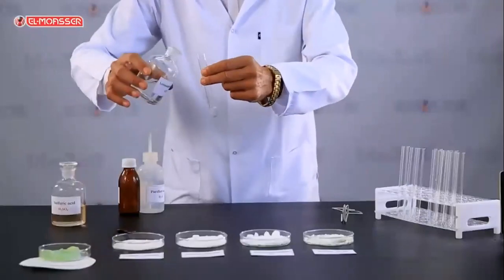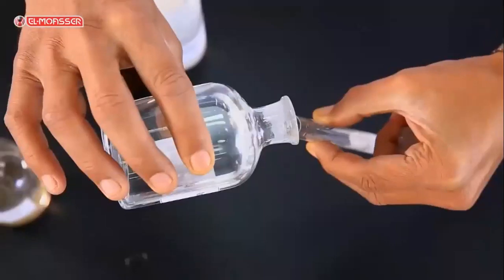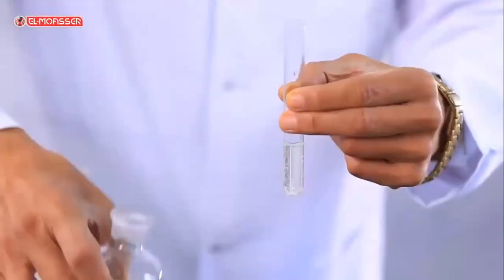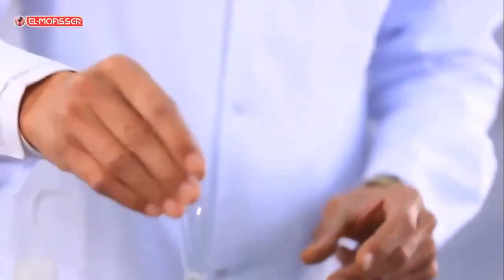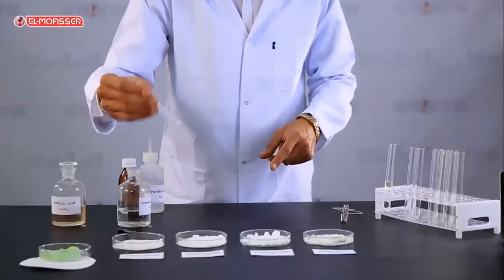Add a concentrated ammonia solution to the precipitate. What do you observe? The precipitate will dissolve in the concentrated ammonia solution.